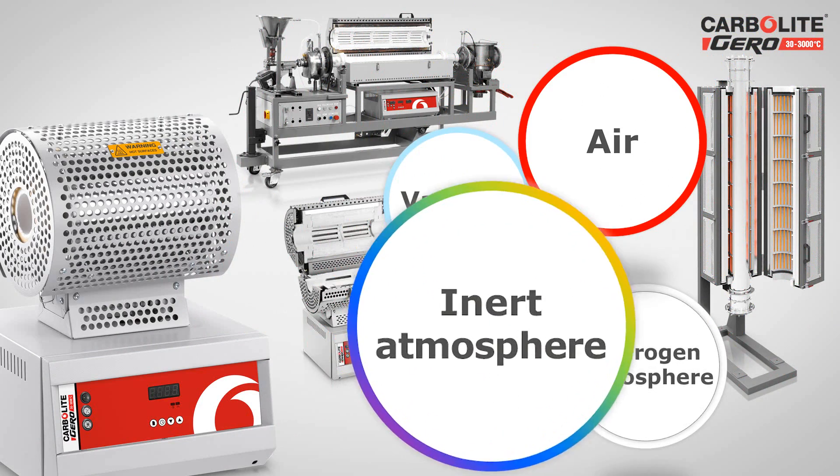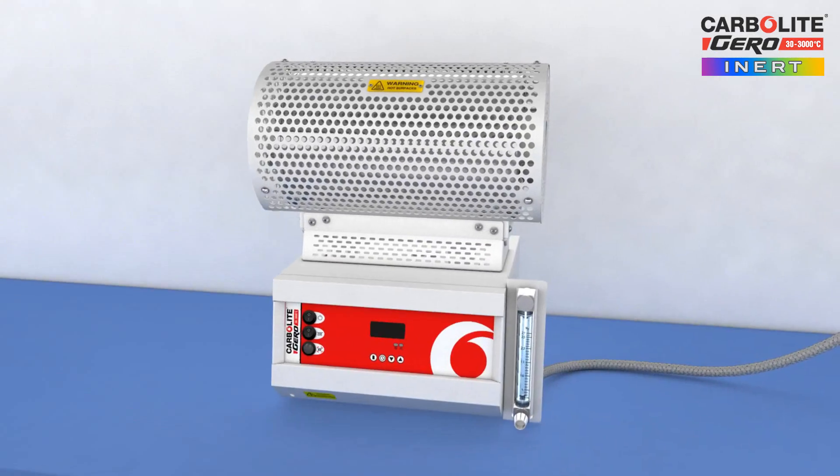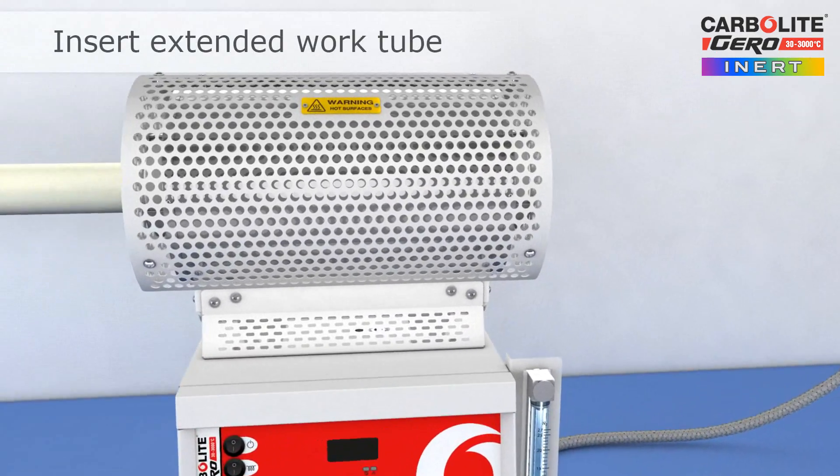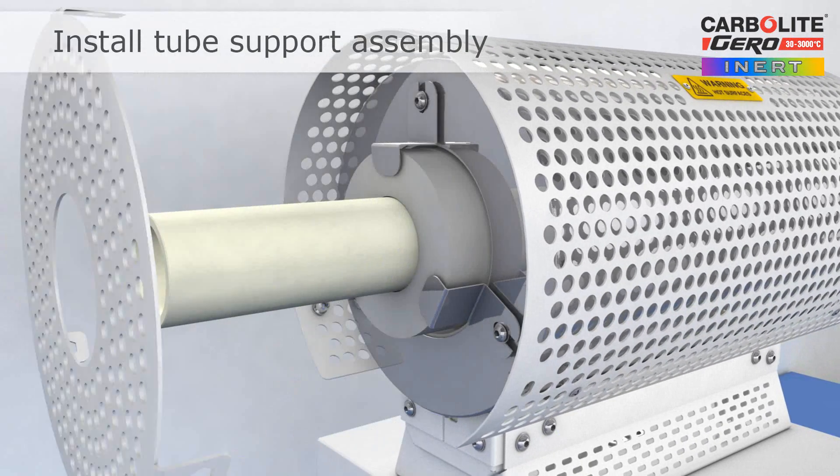For use in inert atmospheres, Carbolite Gero offers a work tube package consisting of an extended work tube, a pair of end seals, a pair of insulation plugs, and a probe thermocouple. Extended work tubes require an additional tube support assembly, which is easily fitted.